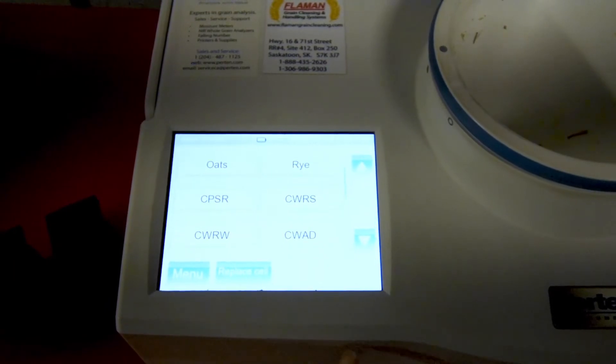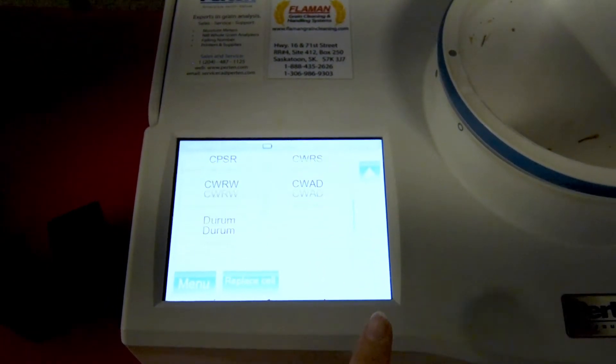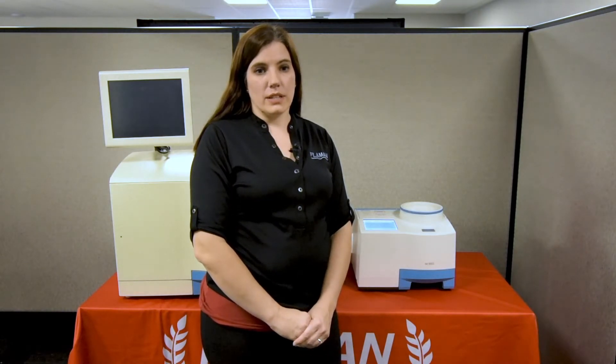This machine not only tests cereals such as wheat, durum, oats, and barley for moisture and protein, it will also test oil content in canola and soybeans, as well as testing lentils and some pulses.